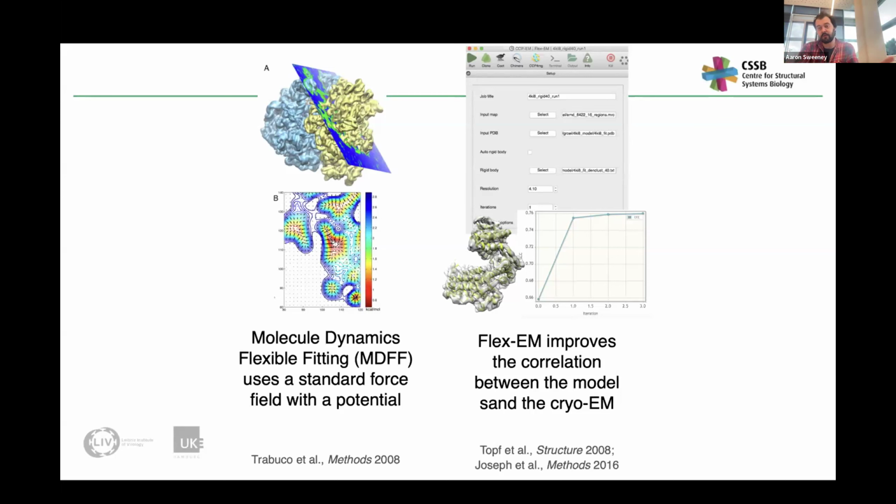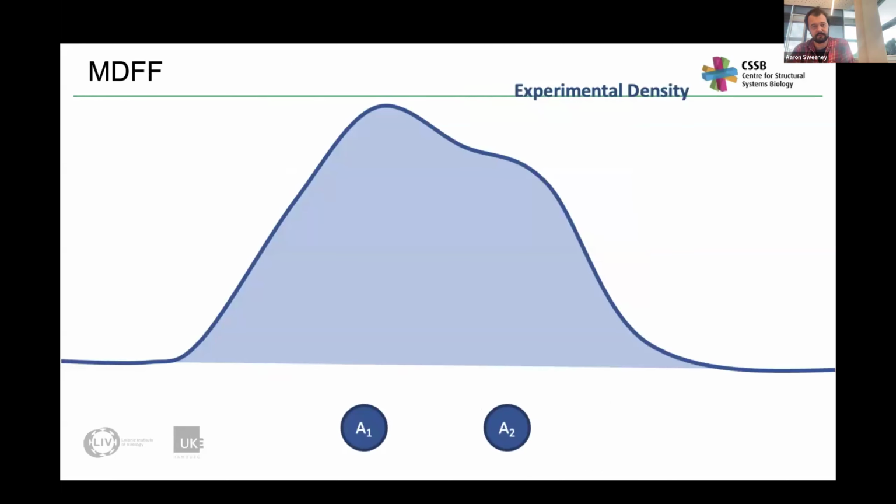TEMPy-ReFF is another approach entirely. It's kind of more similar to the correlation method, but we use a Gaussian mixture model. I'm going to explain now why that's advantageous.